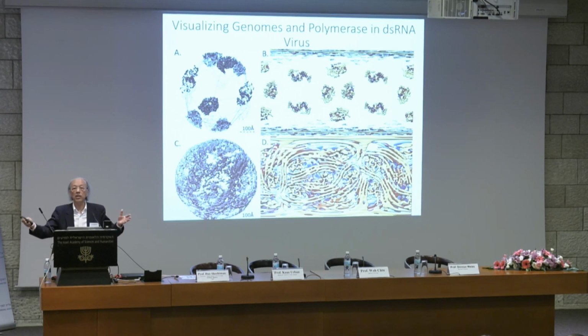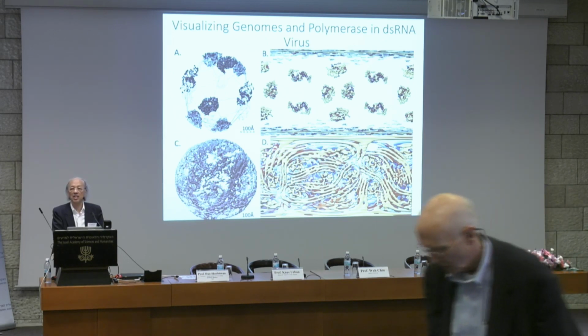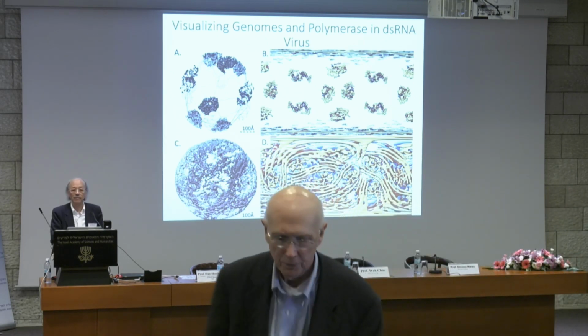In the case of the DNA, it's just a container, basically. In this case, there's a polymerase in the vertices. In fact, there are 9 segments of the RNA, but it has 10 pieces of this polymerase. So that probably is not related to the enzymatic activity, but has to do with the stability of the capsid.